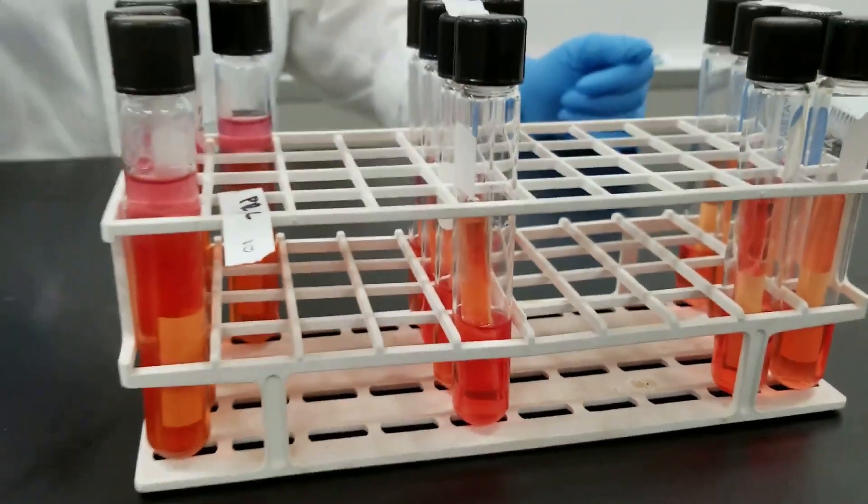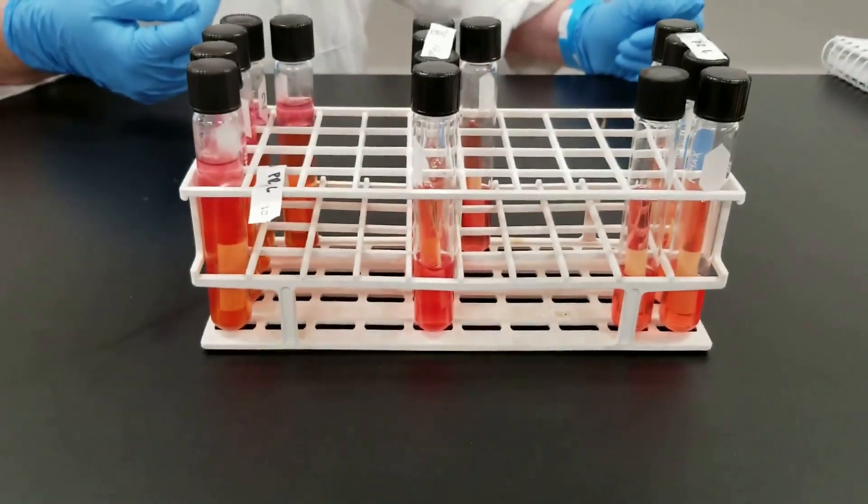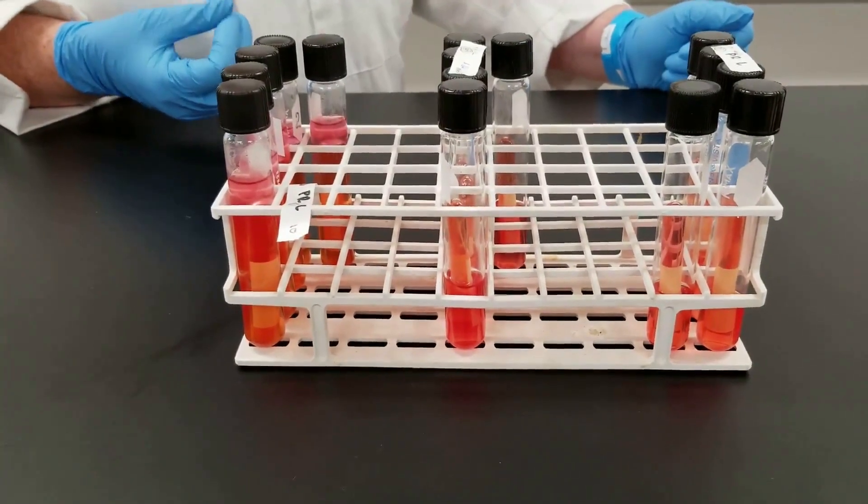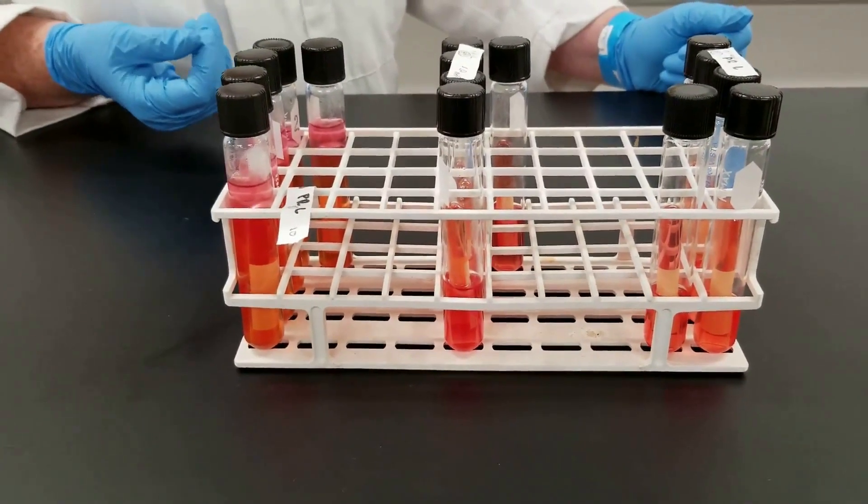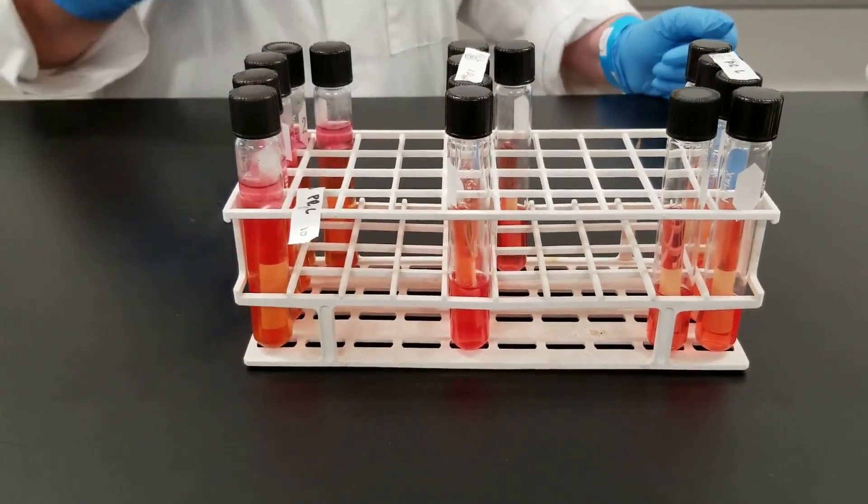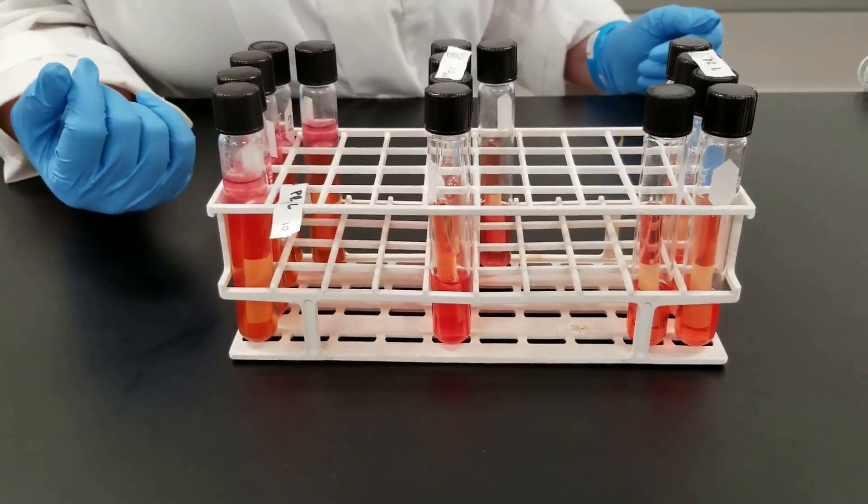You have the phenol red pH indicator. If acid is produced, it would turn yellow. That is what you'd be looking for as a positive result. You also have the inverted Durham tubes to collect gas if gas was also produced.